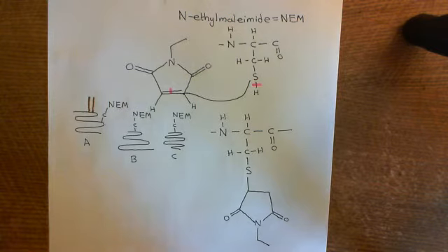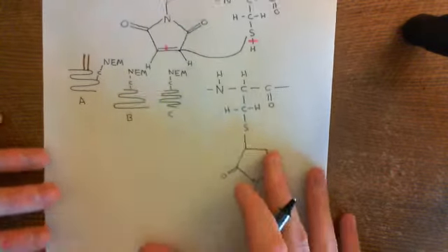Now what we're going to do is split up our sample into 2 basically. So what we have done is we've homogenized our cells, we've got this huge great sample containing proteins now, and so far we've mixed in N-ethylmaleimide to neutralize all of the free cysteine residues on these proteins. And now what we're going to do is simply break up the sample into 2.